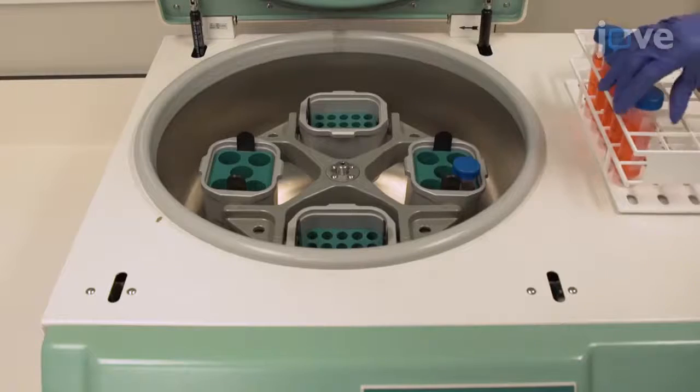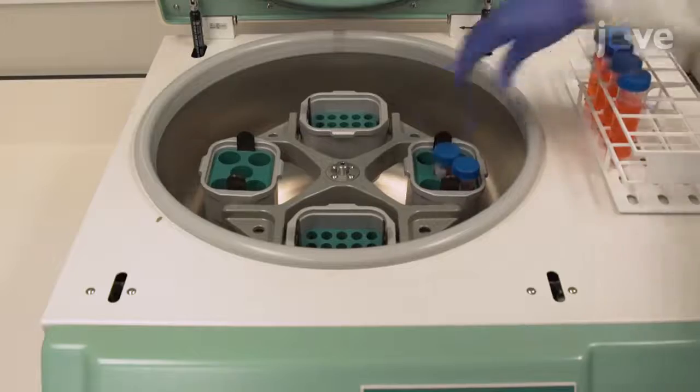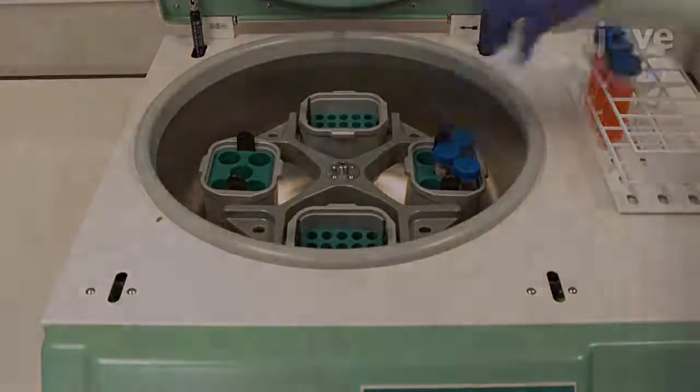Next, use differential centrifugation to remove all of the cells and cell debris from the supernatant.